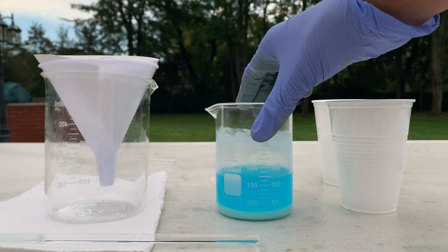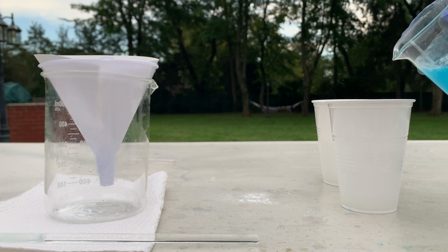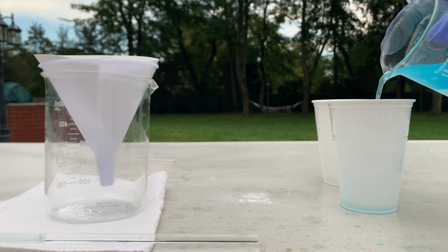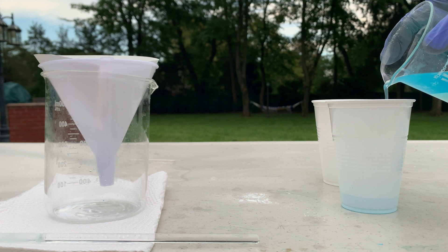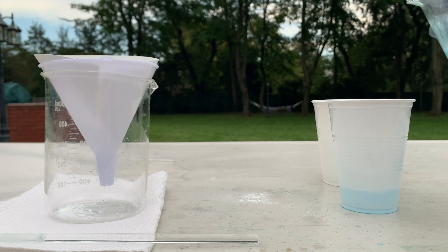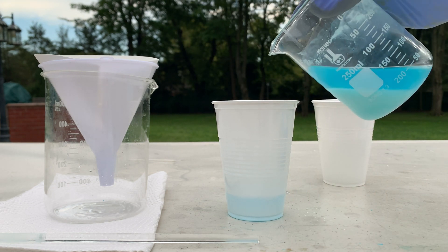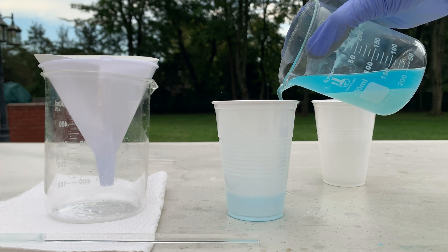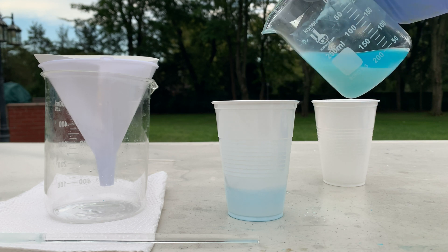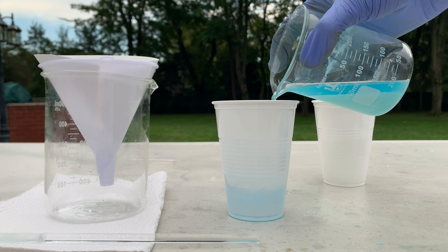I'm going to pour off some of the top solution into a cup. You can see that we're keeping all of the bottom solution but pouring off the top solution.